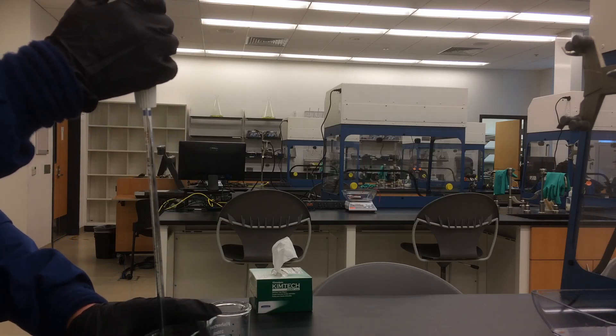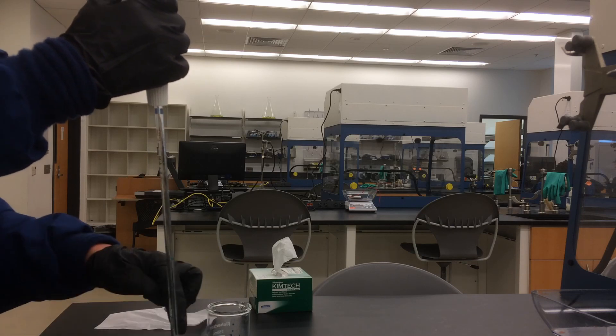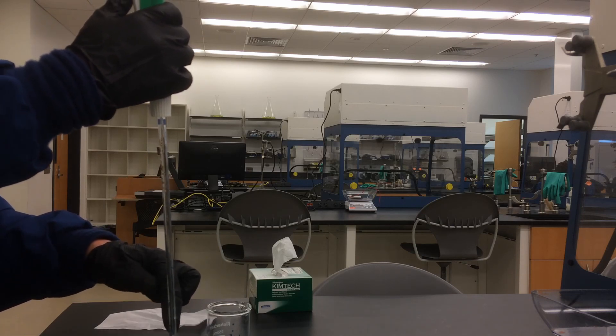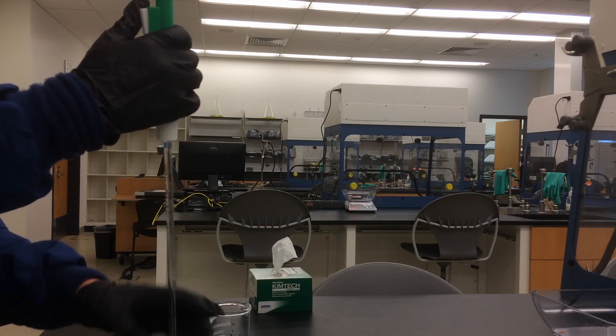The pipette is calibrated taking into consideration that this small amount of solution will remain. This is what to deliver means.